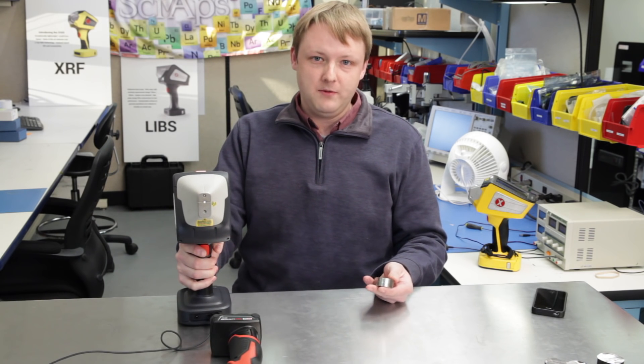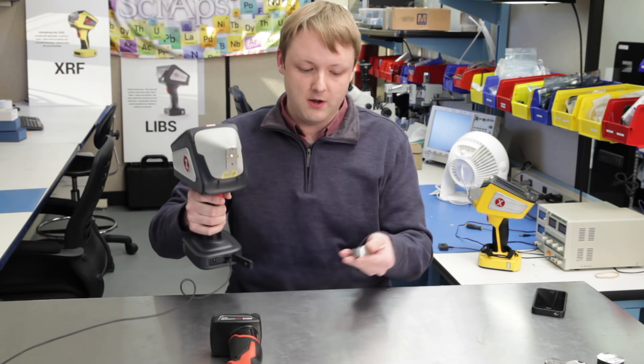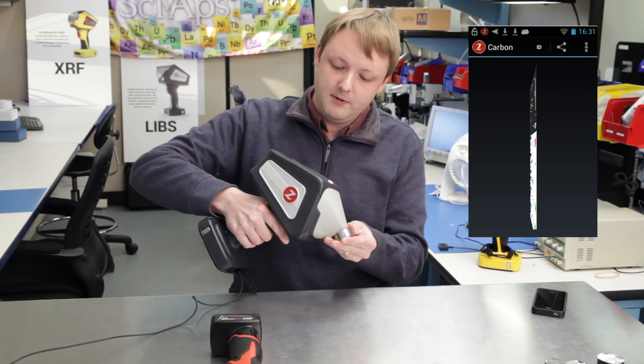For testing carbon, we usually do an average of a couple of results just to make sure you can improve your precision as much as possible. I have a 4130 sample here, so I'll just test this a few times and we'll see the carbon value.